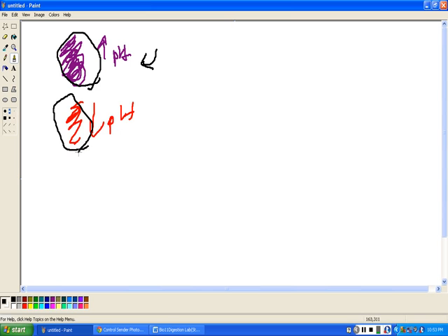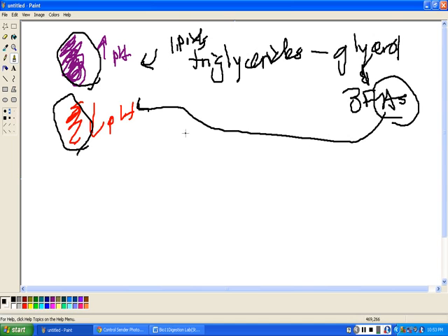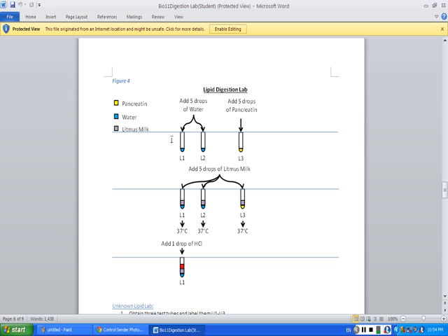How do we turn milk to be more acidic, though? Well, we're using whole fat milk, so there are a lot of lipids in here. And what kind of lipids are we talking about? Triglycerides. What are triglycerides made out of? They're made out of glycerol and three fatty acids. And the acid portion of the fatty acids will cause the pH to lower, making the litmus detect the acidity, changing it into a reddish color.